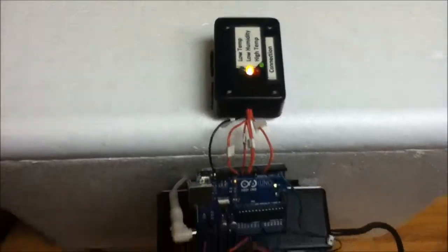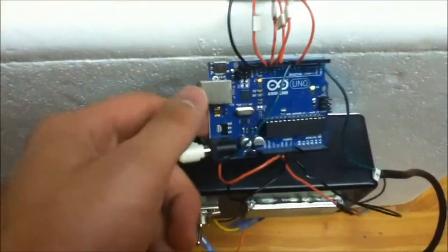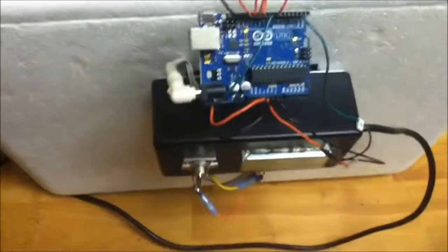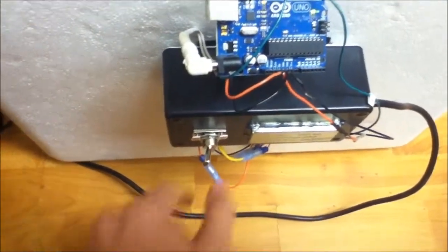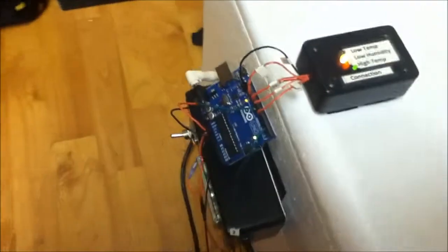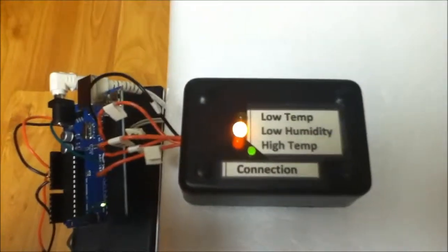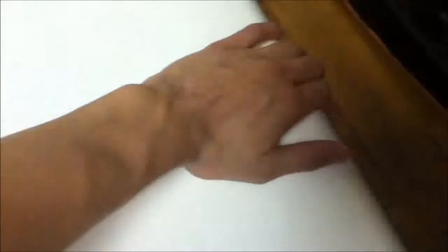This is a project that I did my senior year of high school. I wanted to replicate some biology experiments that I thought were pretty neat, but they're very expensive, so I built my own cell incubator. As you can see, it's powered by an Arduino, and it's powered from the wall. I set up the power supply and everything myself.